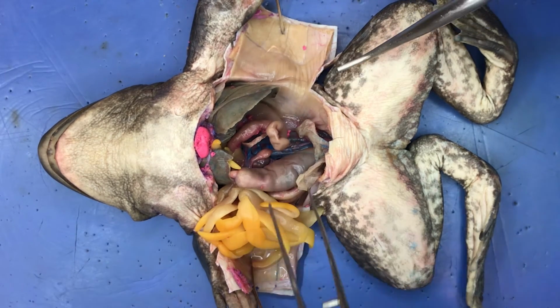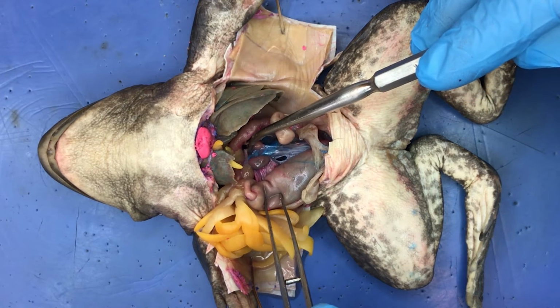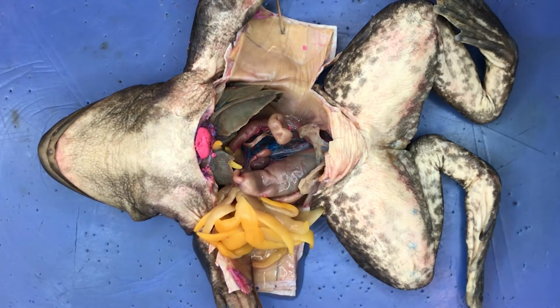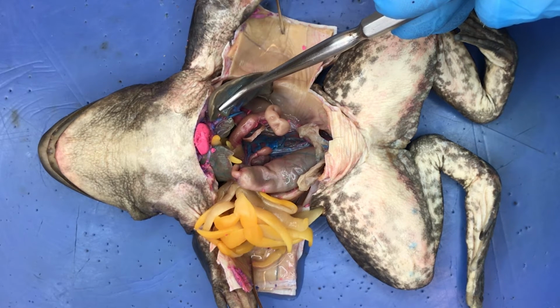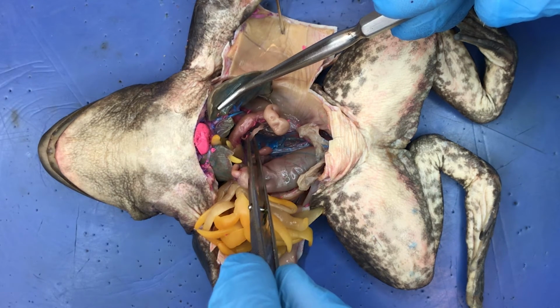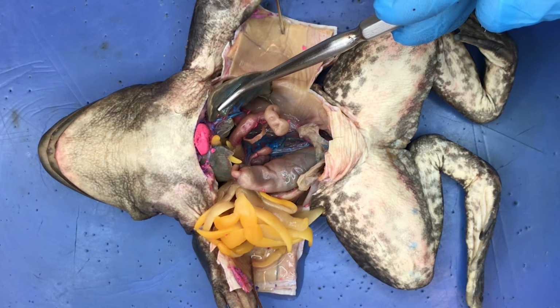A dark-colored spleen is located within the mesentery, suspending the stomach and small intestine. The stomach continues and ends posteriorly in a constriction, which is called the pylorus. That is where the small intestine begins. Within the first loop of the small intestine, we see a slender S-shaped pancreas lying parallel to that first loop and under the stomach.